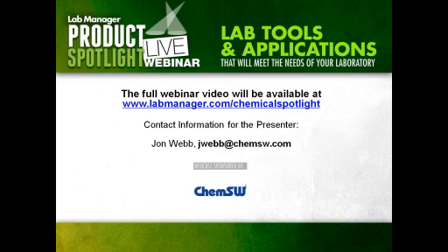Okay, and just to follow up on that comment that you just made, here's a question: do you recommend then barcoding all chemicals that are brought into the lab? Some of them may be off-the-shelf chemicals or fertilizers that may have been purchased from a chemical company, or it could be items that have just been bought in a grocery store, like acetone, say. So do you recommend then tracking every single item in the lab?